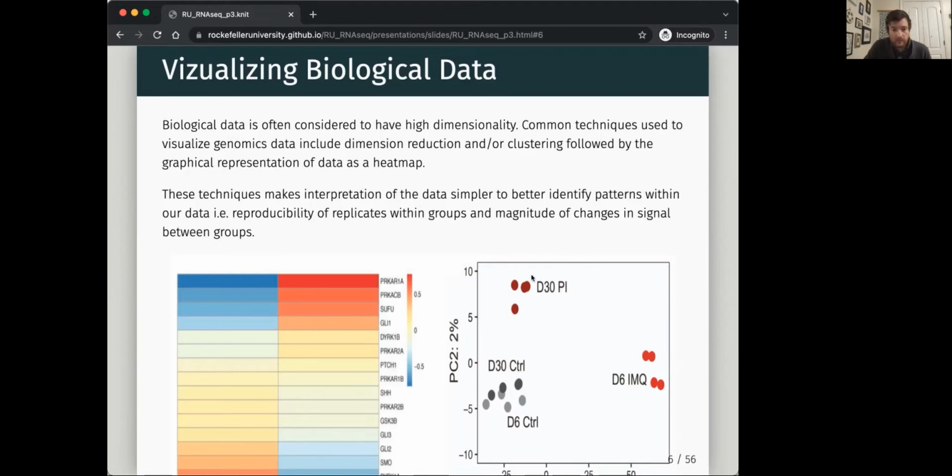And so you can see this heat map here of several genes belonging to a specific gene set. And they've been clustered as well. So the specific patterns have been clustered together on a row-wise basis, and similar patterns are near each other. And so this can really start to help you understand what's going on.